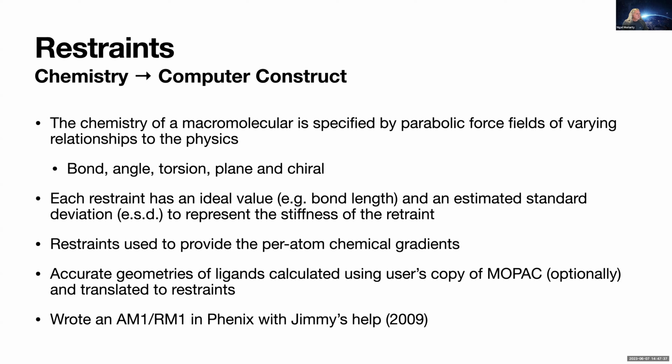To do this, for the longest time, I've used both. If a user has MOPAC installed, they can optionally use MOPAC to calculate good geometries of their ligands, which is the target mostly, because proteins and nucleic acids are fairly well known, so that they don't need to calculate the accurate geometries of that.